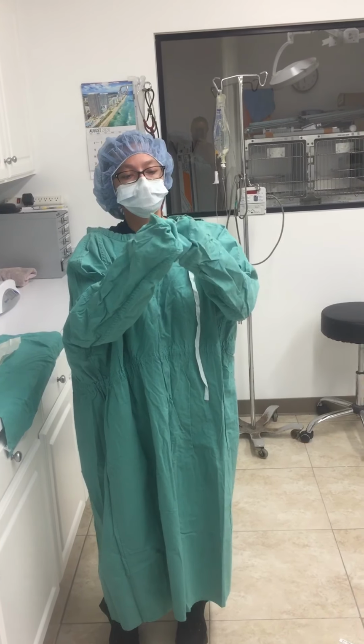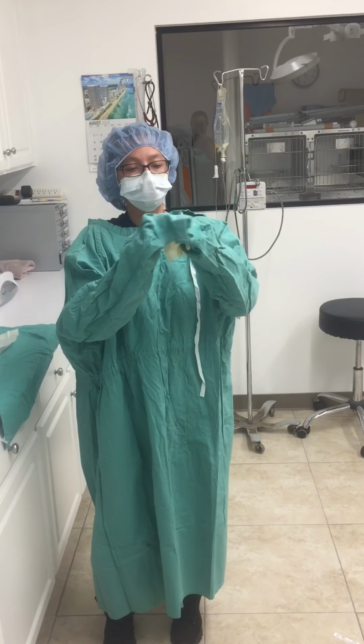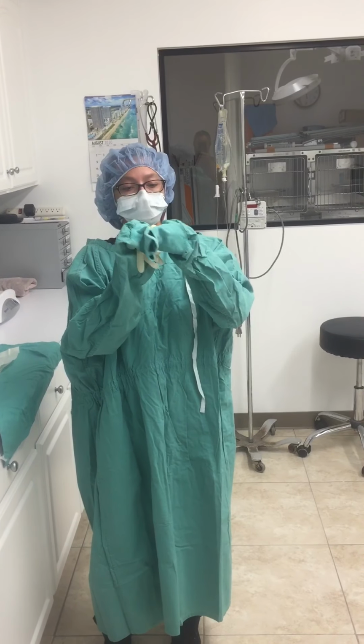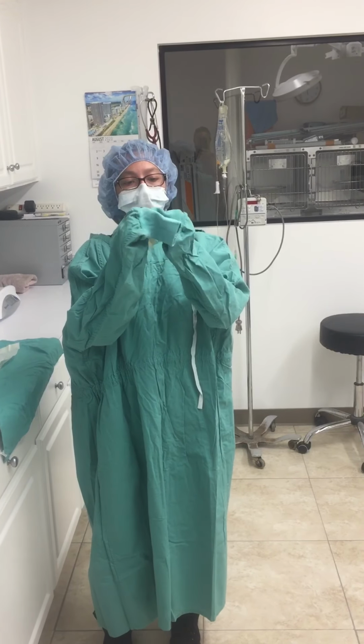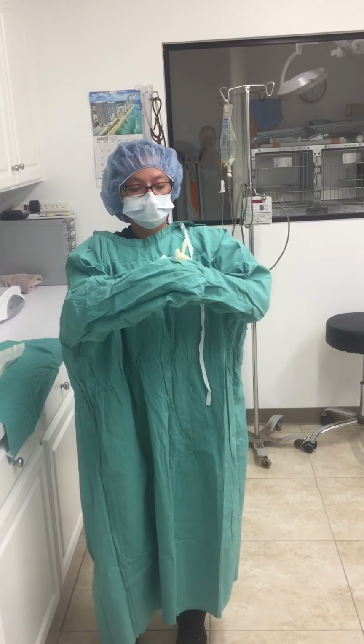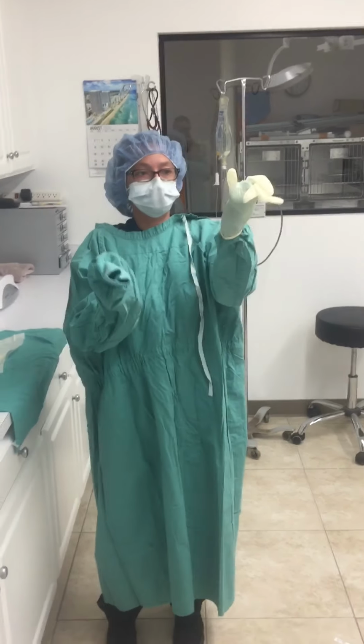These gloves are too small. Oh man, sorry, misplaced my finger. All right, so I've got finger and cuff, and it should flip. Oh my gosh, these gloves are too small. And they go right on and snap, and you leave them there.